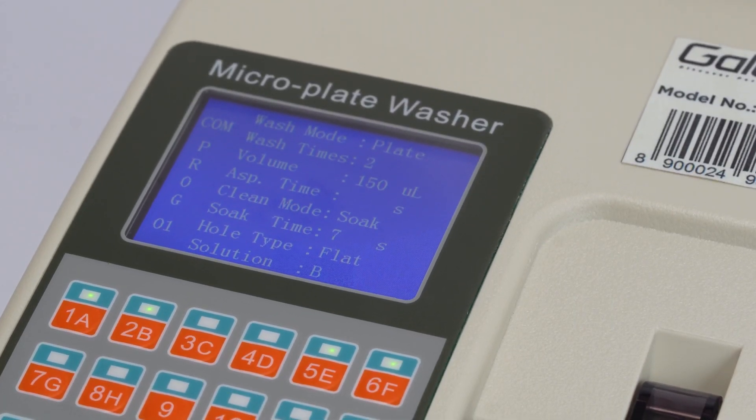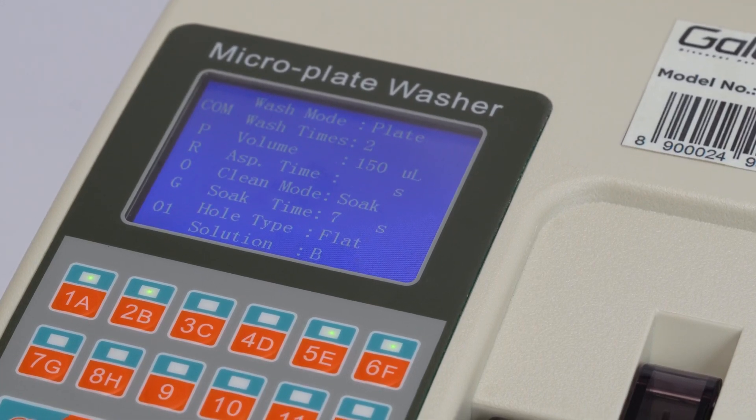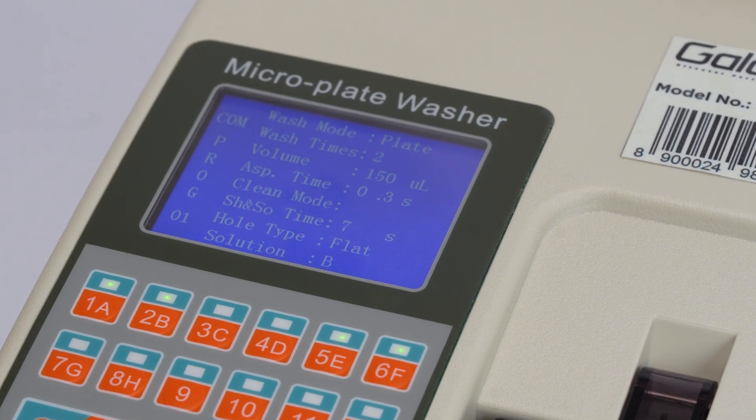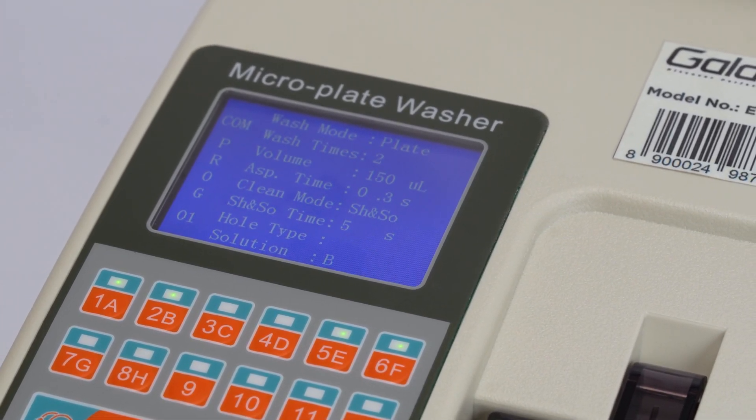Set aspirating time from 0.1 to 9.9 seconds in 0.1 second increments. Select clean type: soaking, shaking, soaking and shaking. Choose hole type: flat bottom, round bottom, U shape, or V shape.